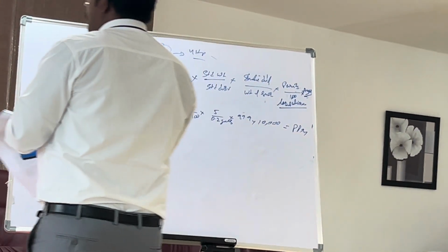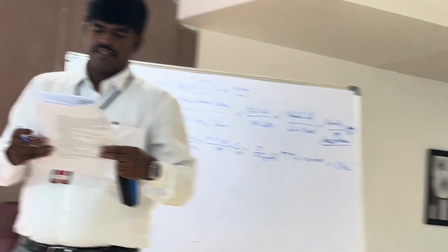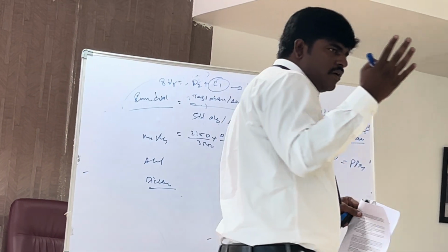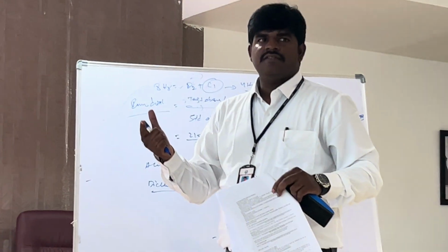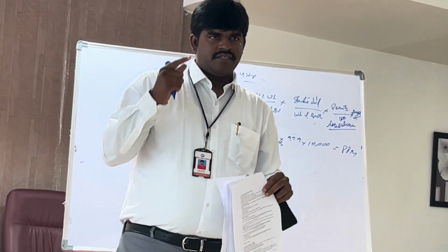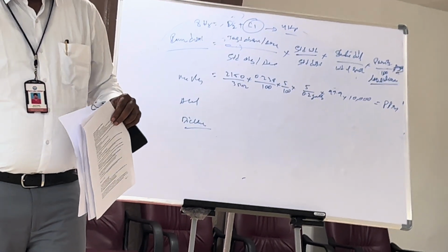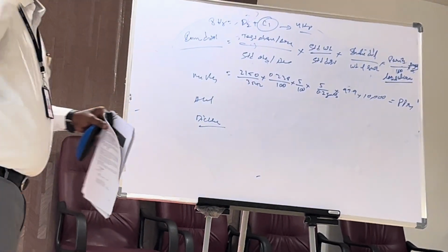And the next, related substances. In related substances, I don't want to go in depth. Normally, related substances can be assessed by three methods. One is the area normalization method, the second is the diluted standard method, using the correction factor value against the standard dilution, and the third is impurity against impurity. Simplest way. There are no other techniques, don't bother with any others.